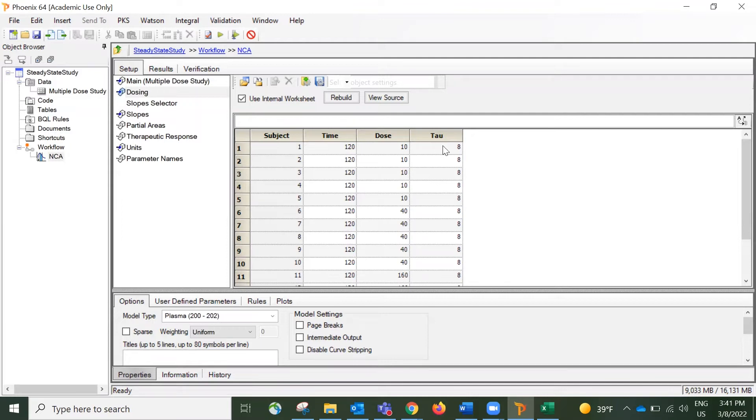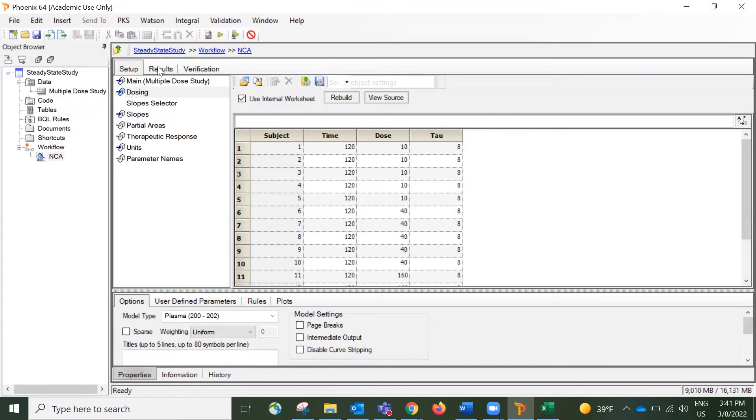And for the tau column, I entered 8. So this is the dosing interval for this multiple-dose study. And now everything has been set.